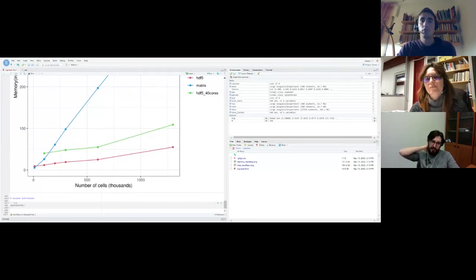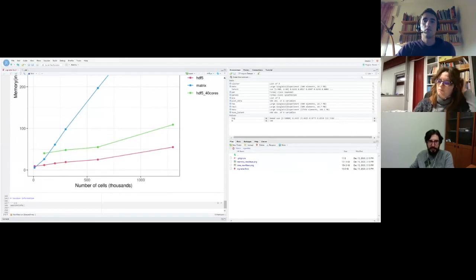Yeah, I agree. I think you need some kind of gene selection. In this case, it's a very simple gene-wise variance, but there are other deviance-based methods or coefficient of variation methods to select the genes. I agree that having a filter on genes is usually good, not only for computational performance, but also for the signal. It's more clear, or at least definitely not improved when you use all the genes.